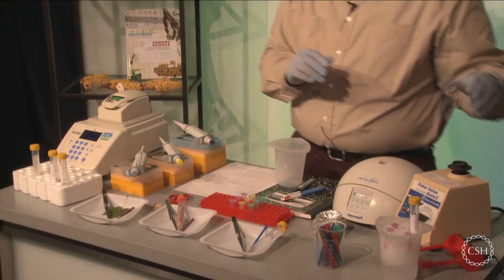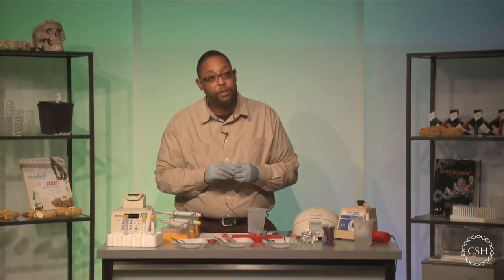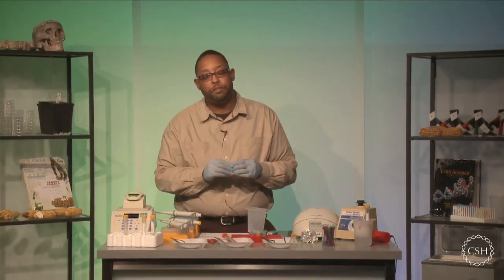Okay, so what we're going to do is just get started, and I'll show you how to do the isolations from all 3 of these types of tissue here.